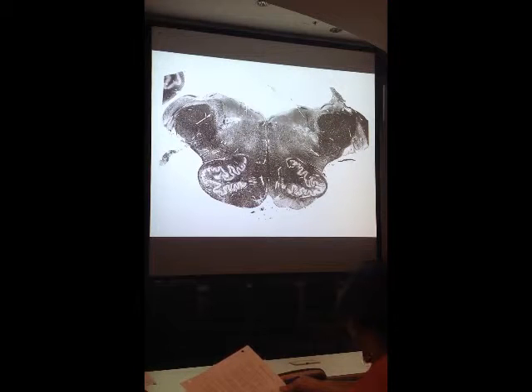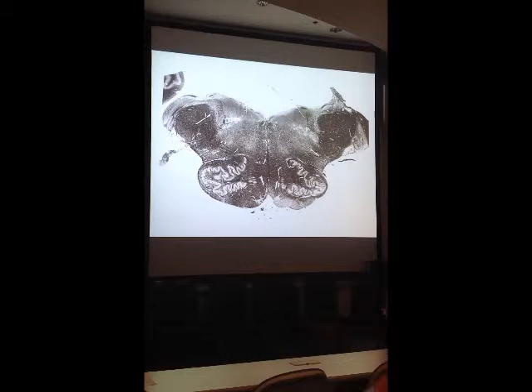In addition, on this slide, from the previous slide, we should expect to follow downstream the spinal trigeminal nucleus and the spinal trigeminal tract. So spinal trigeminal nucleus, spinal trigeminal tract right through here. Now this is a cerebellar peduncle right here, and this is the inferior cerebellar peduncle. It can also be called the restiform body. So this is slide 12, upper medulla.